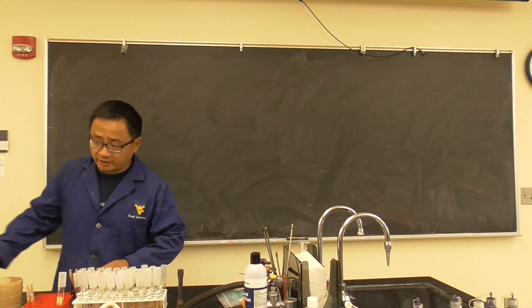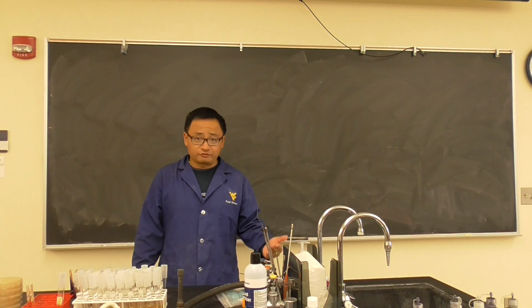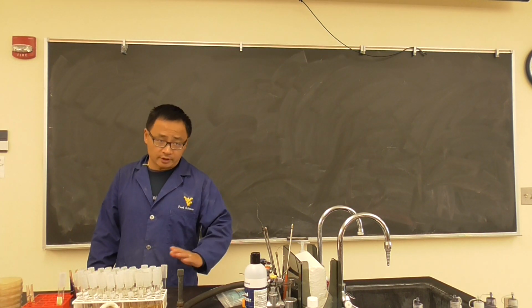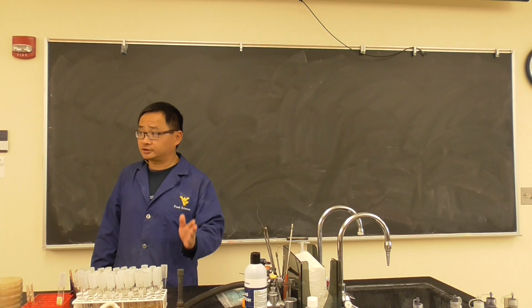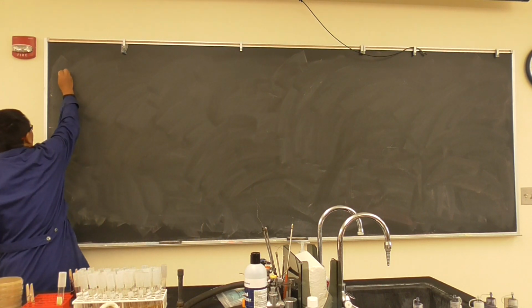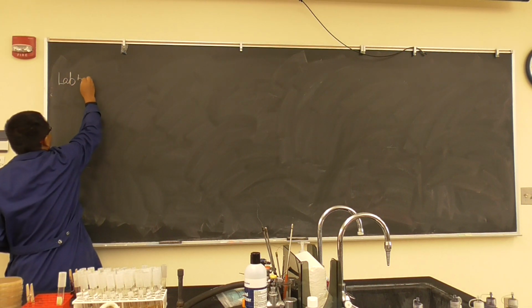Okay, good morning. Let's have a class. Today's lab is pretty straightforward. It's very simple. You don't want to spend so much time, but there are some concepts we have to emphasize, especially the label. That's the number one important issue in the lab. So what we're going to do today, this is lab 5.